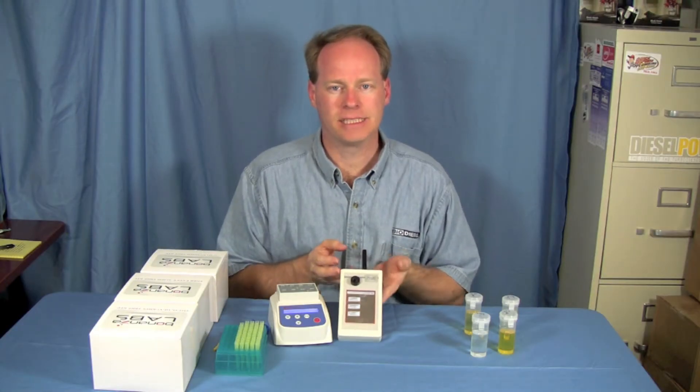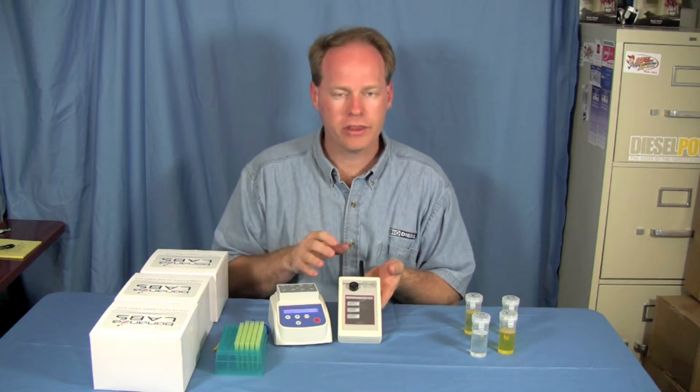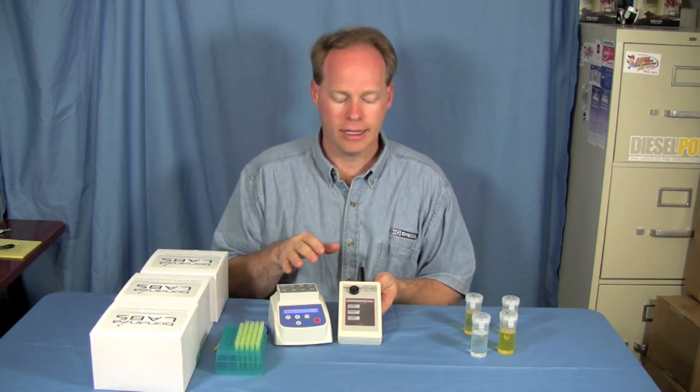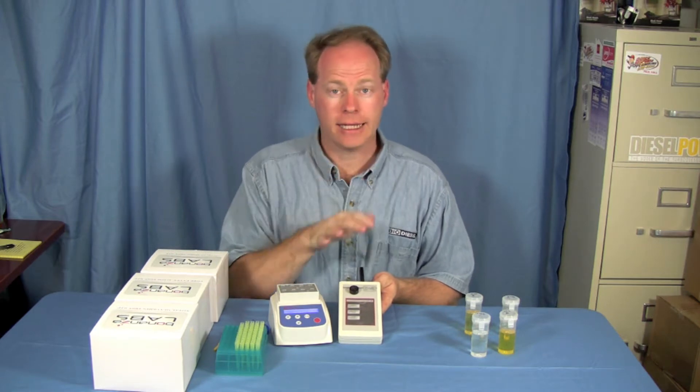The mini scan from Bonanza Labs is a really cool tool. We think it's going to really help people improve the quality of their fuel both at a commercial scale and at a small scale.